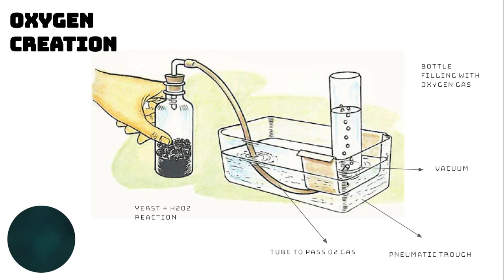and then you're going to pull out the piece of cardboard or whatever it is quickly so that no air goes inside the bottle. The mouth of the bottle is then sealed over the hole in that attachment, allowing a vacuum to form as the water in the bottle meets the water in the trough with nothing in between.